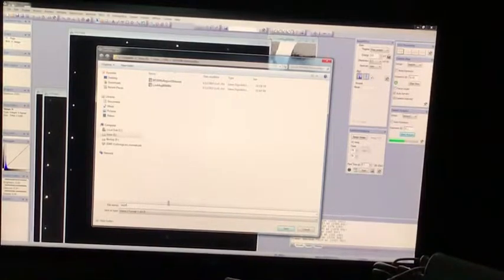So SADP, lower camera length, green region of interest. Save.